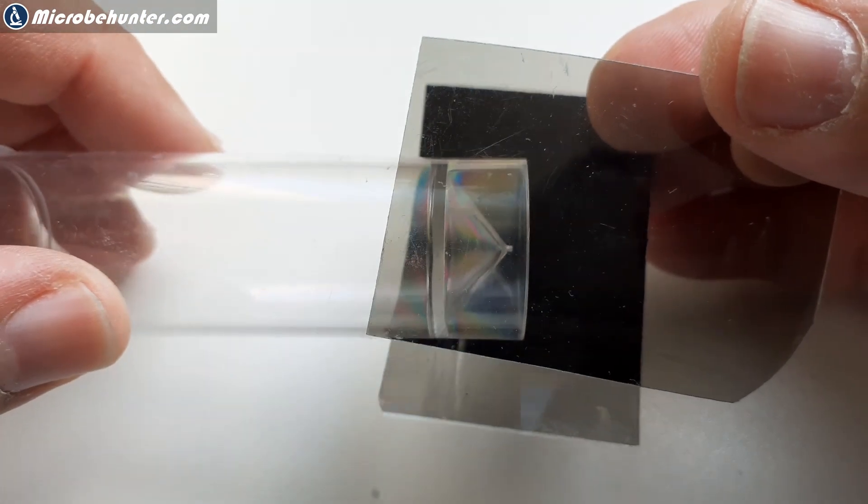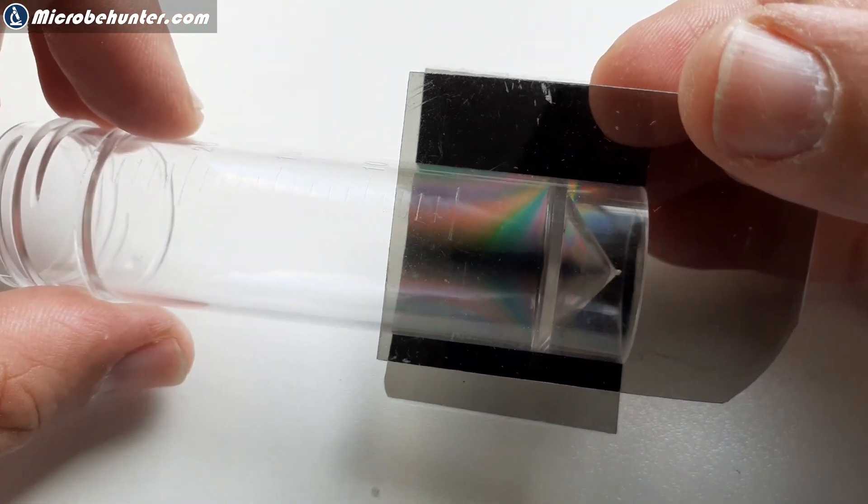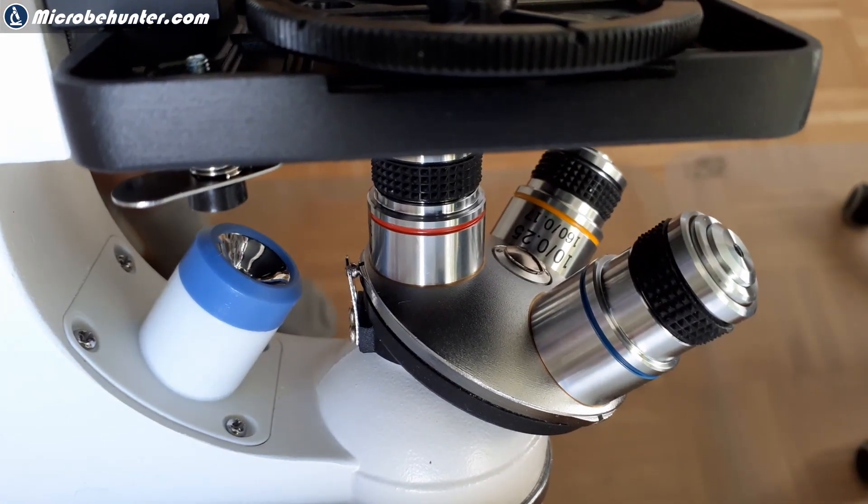If you put some plastic in between those cross polarizing filters then you can see that there are these rainbow colors. It actually shows that the plastic is also kind of depolarizing the light a little bit. It shows that it actually works.